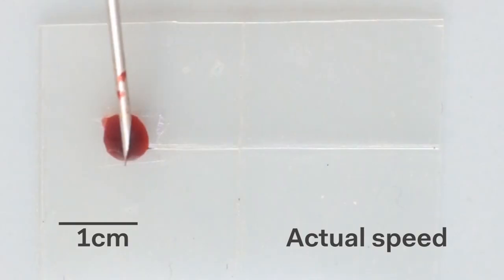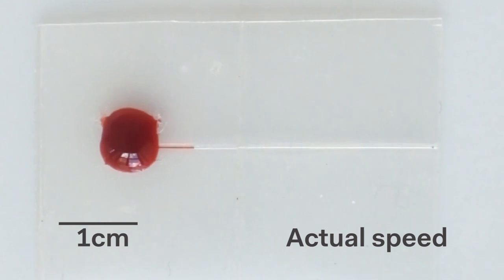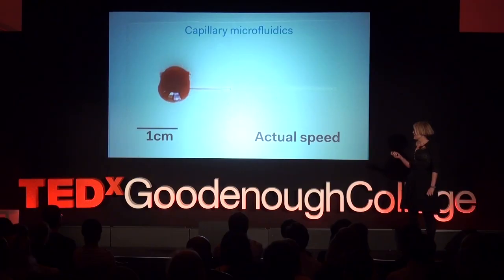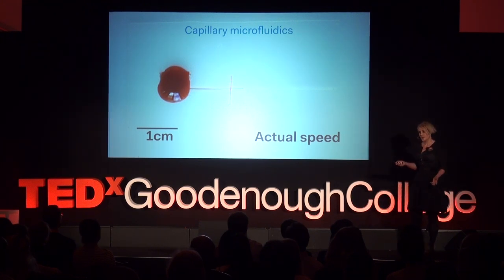We experimented with food coloring as a fluid, and as you can see, it gets drawn into that central channel. This video is in real time, and to me it's really surprising how fast that fluid is moving on its own. Since this chip is moving tiny amounts of fluid around, it is essentially a microfluidic chip.